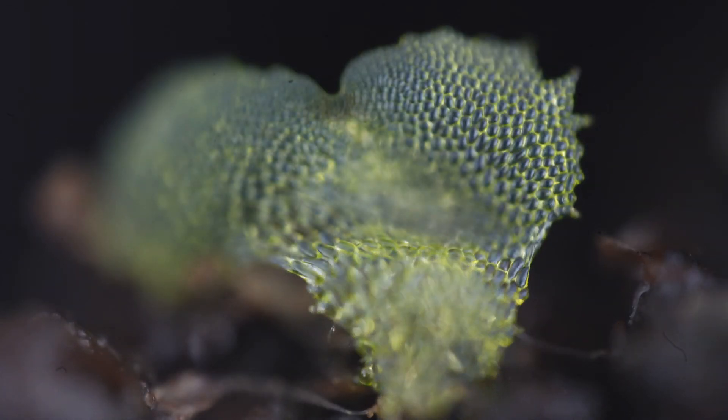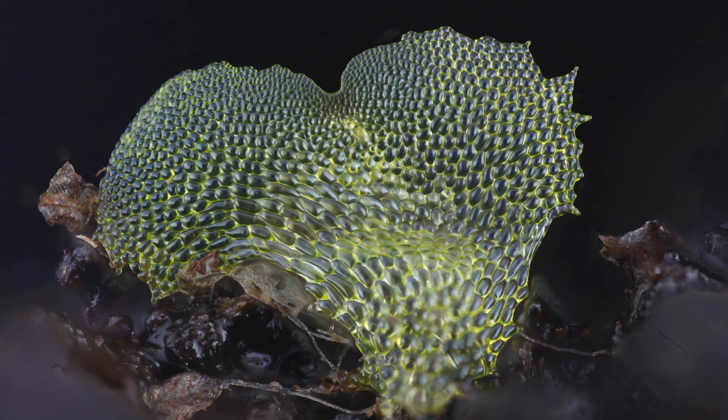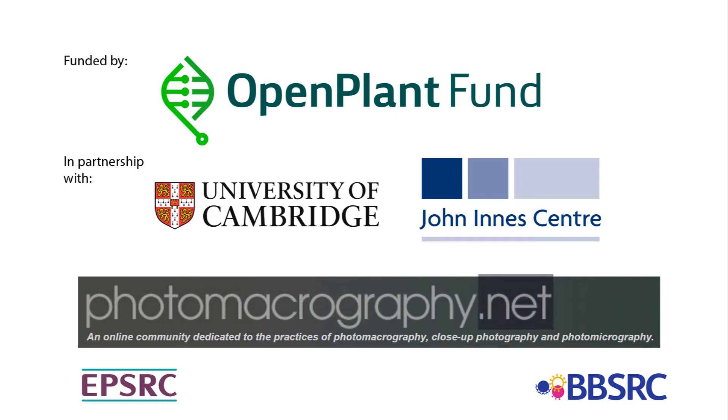Here is another example of the series of photographs taken as the camera moves its plane of focus through a gametophyte fern, and this is the compiled image that combines all of the focused parts from the slices. This is the technique of focus stacking that we are using to take deep focus images of tiny subjects. If you would like to read more about our focus stacking work, about the photography of Professor M.B. Wilkins, or about the BratCam by Chris Slabaugh, please visit chlorophyllosophy.uk. Here is another example. Thank you.